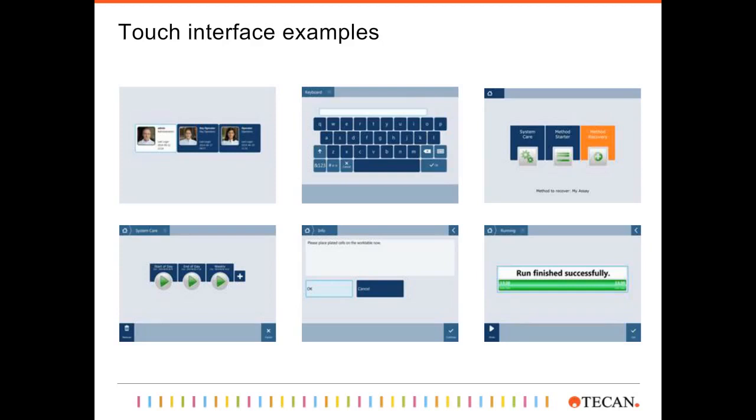Now, behind that is a configuration software package designed for creating the work tables and for programming some steps. We'll give you a quick demonstration of it here with another video, so I'd like to get that started now.